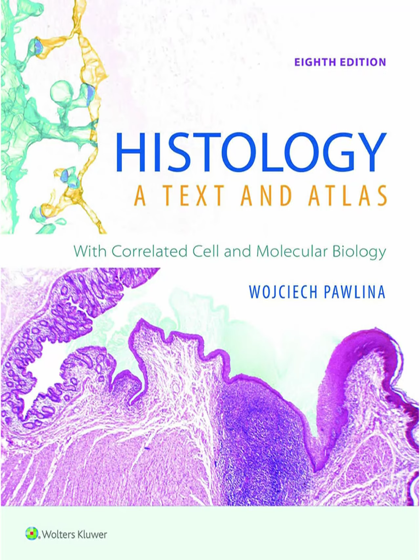So what types are there? Two main types. First, the transmission electron microscope, or TEM. Here, a beam of electrons passes through an extremely thin specimen section, much thinner than for light microscopy, maybe 50 to 100 nanometers. Different parts of the specimen scatter or absorb electrons to different degrees, especially after staining with heavy metals like lead or uranium to add contrast. This creates an image on a fluorescent screen or digital detector, showing internal ultrastructure, organelles, membranes, viruses.